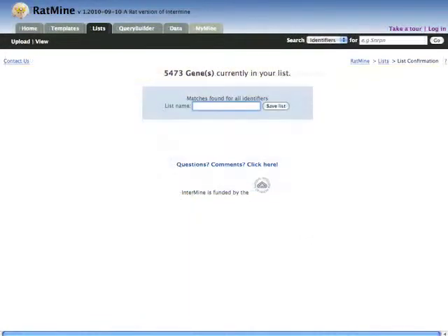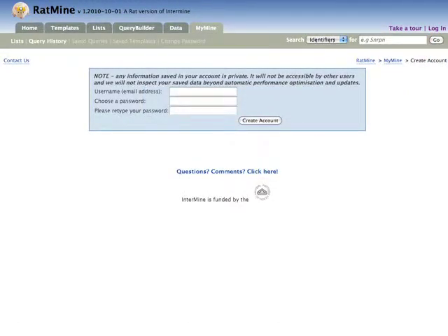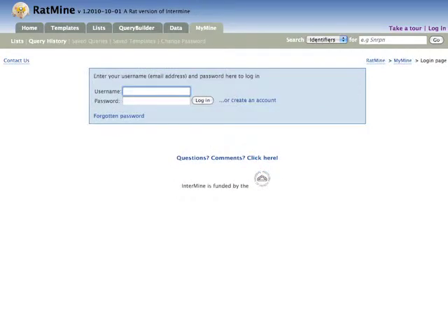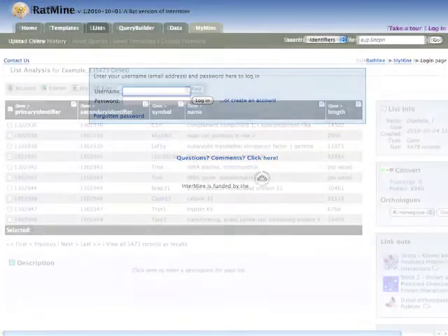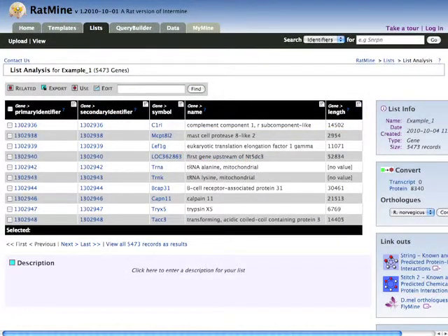You will be prompted to give your list a name and then save it. If you are not logged into RatMine, any lists you save will be lost when your session ends. However, registering for a free account and logging in will allow you to save lists permanently to your account and reuse them at your convenience. Once you have saved your list, you will be taken to the list analysis page for that list.